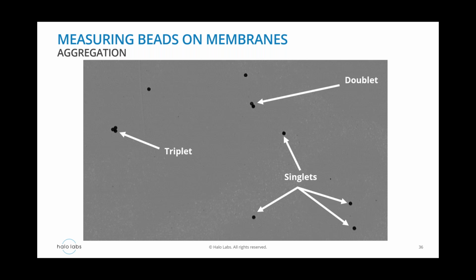While that's an undesired effect, at the end of the day you do have the same amount of mass there. And think about it this way: what USP really cares about is the total mass, the total undesired subvisible material, the amount of junk essentially that is being injected. You want to limit that. Particle distributions give you greater insights, but fundamentally, you just want to limit how much material gets in there.